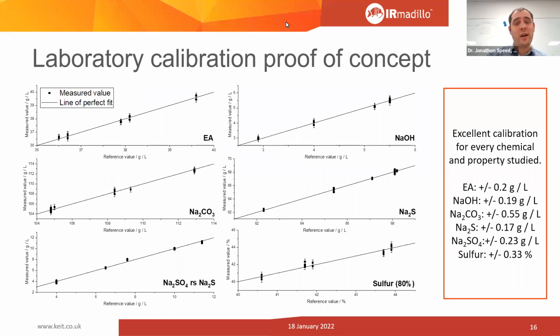So for example, you can evaporate something down to dryness and see what the total dissolved solids were. If you took an aqueous mixture and evaporated it to dryness in an oven, that gives you a solid. You can measure how much is there. And then you could wash that with acetone, for example. That will dissolve away things that are soluble in acetone, and you can see how much of that is. So you'll be left with inorganic salts that won't dissolve in the acetone, and all your hydrophobic stuff will dissolve away. And that gives you a number that we could then use to feed in.